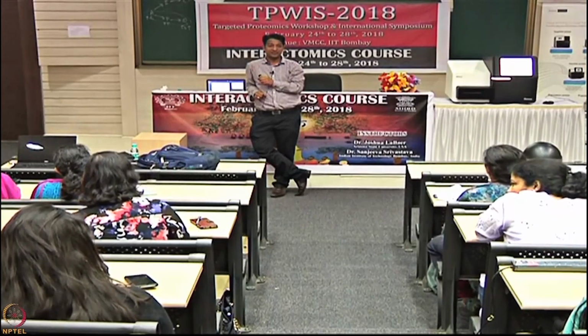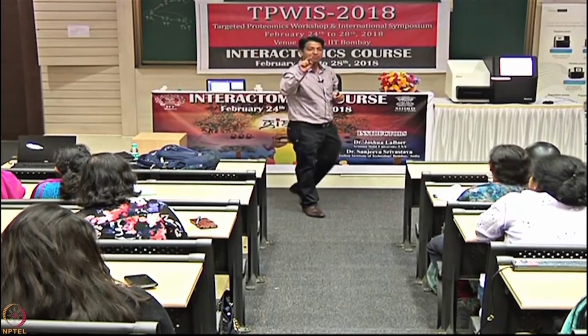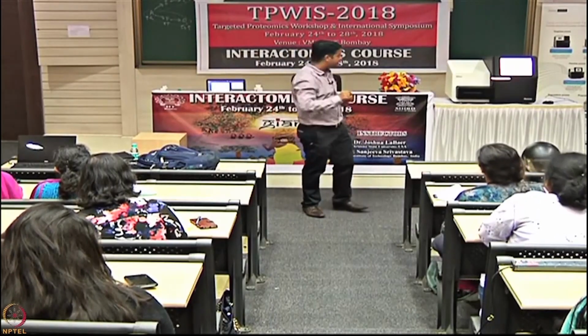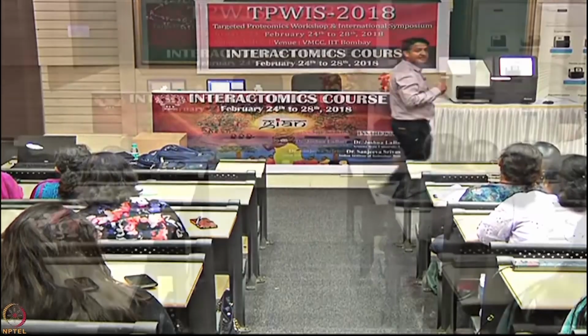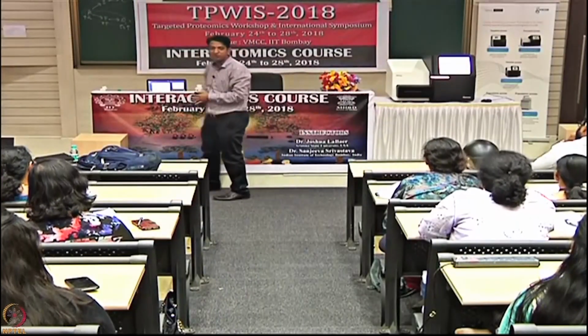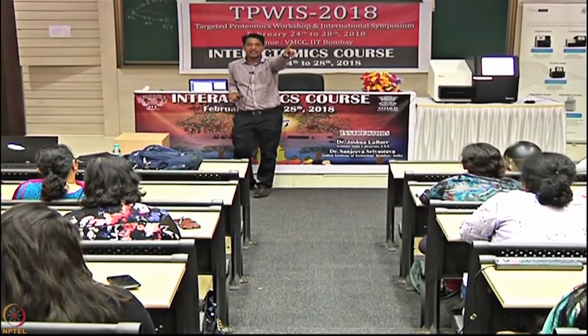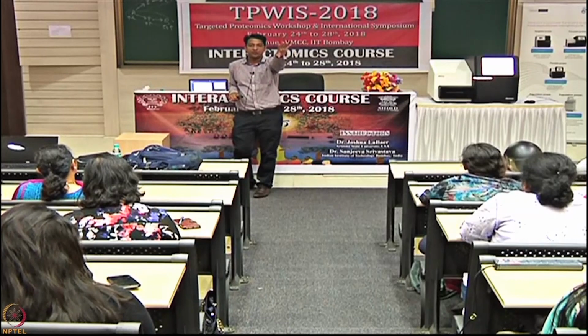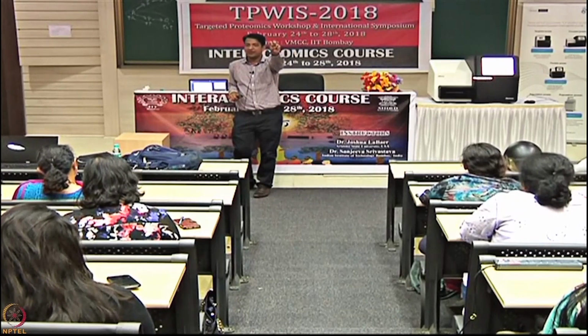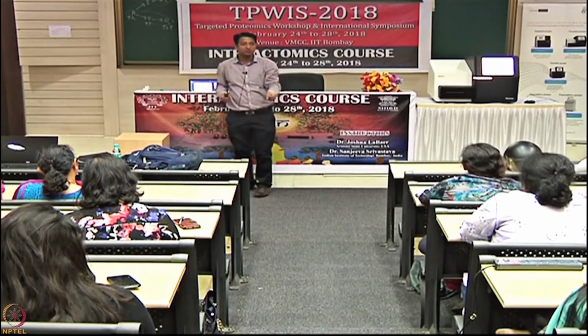3 million. So 3 million Sanger reactions you need to carry out to complete the human genome sequence. And the sequence you will be getting will be covered at 1x coverage. So even if you carry out 3 million reactions, how many times will you be covering your bases? 1 time. So the coverage will be 1x. So if you wish to sequence a human genome, do you wish to invest 10 more years?